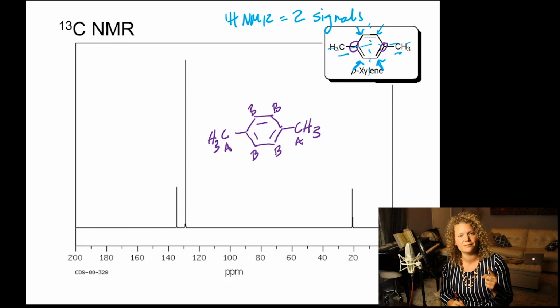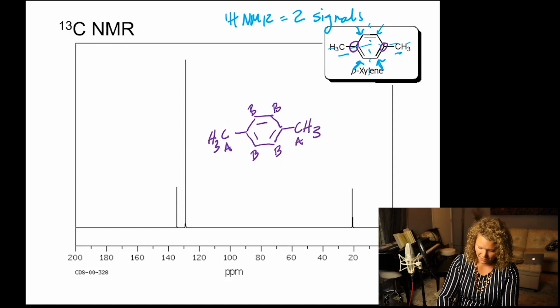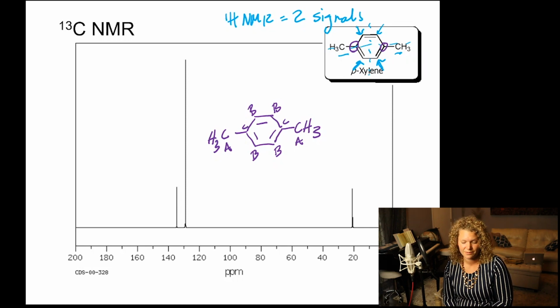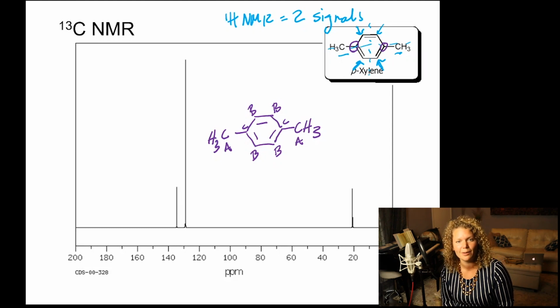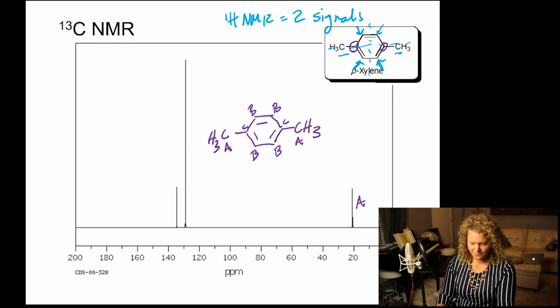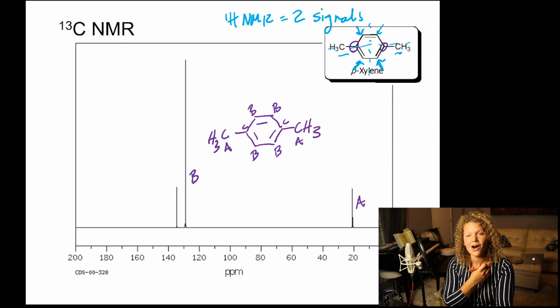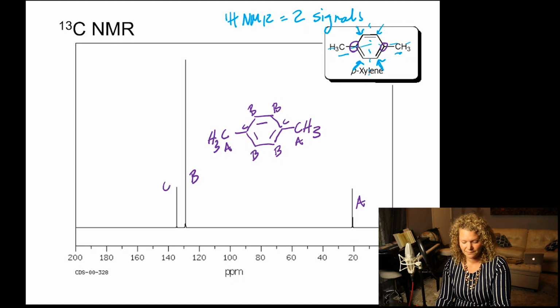And we have one more type of carbon environment. We have a carbon that has no hydrogens, right? We're going to say this is C. And in this case, we show that there should be 3 signals. One thing you'll note is the chemical shift is also very apparent in the carbon NMR. A is the lowest ppm shift here in this NMR. Our next signal is for B, and then our final signal is on C.